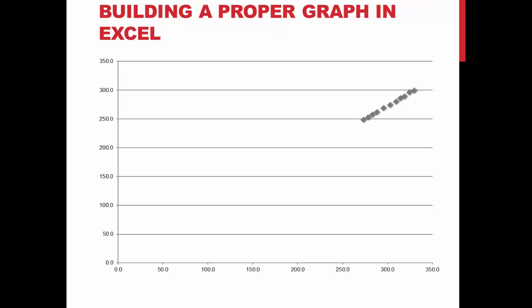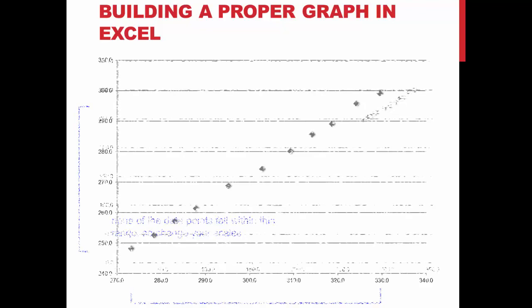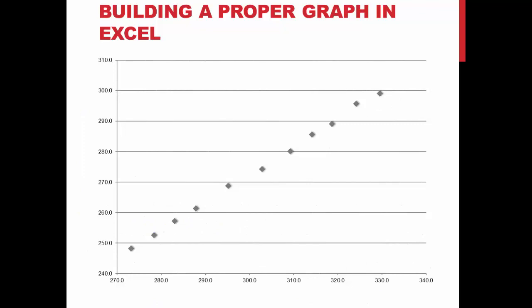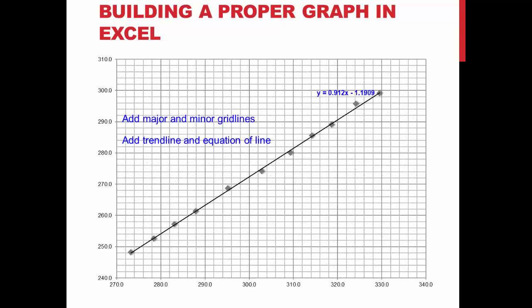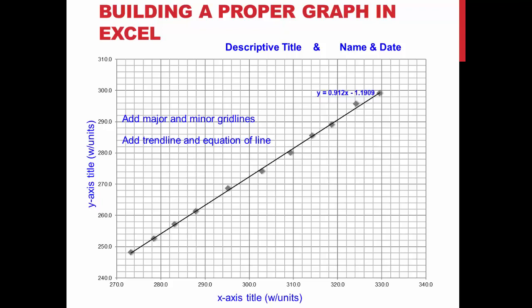What are some aspects missing from this graph? None of the data points fall within the lower region of the graph, therefore the scale must be changed. The major and minor grid lines are not present. A trendline and the equation of the line are missing. A descriptive title and name and date are missing. The y-axis needs a title and should include units, and the x-axis needs a title and should include units.